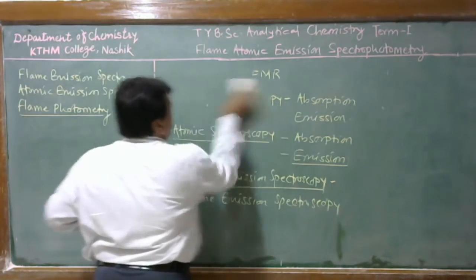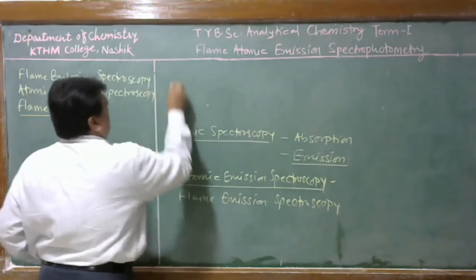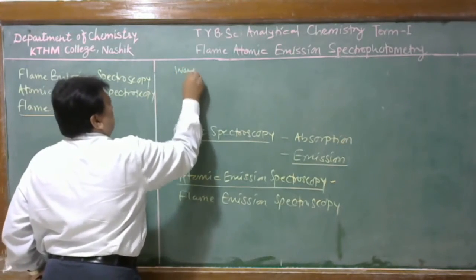Every spectroscopy technique measures two important parameters. The first one is wavelength.